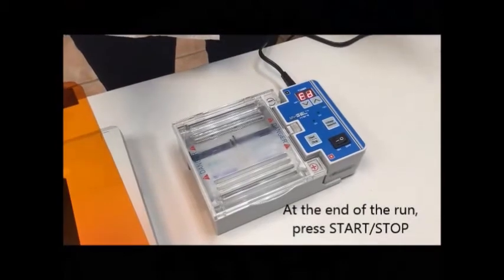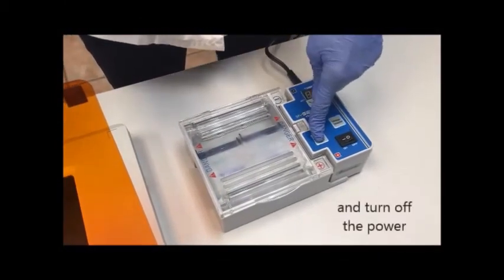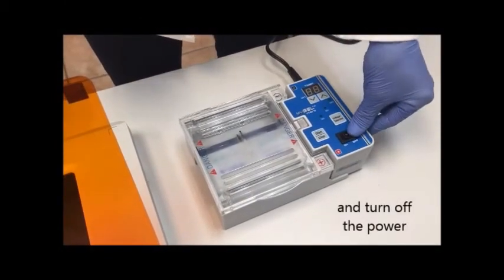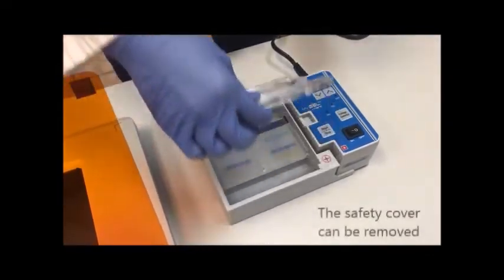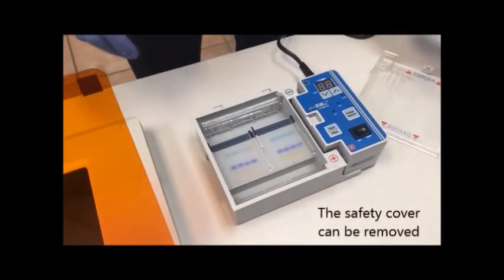At the end of the run, press the start stop button and turn off the electrical power. You can now remove the lid and remove your gels.